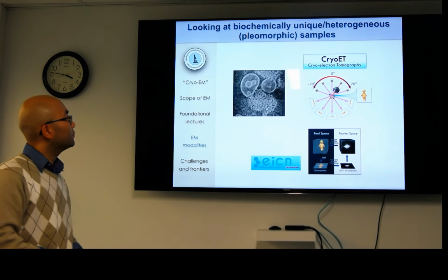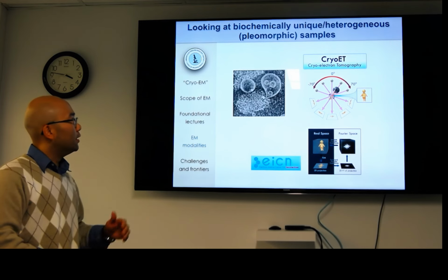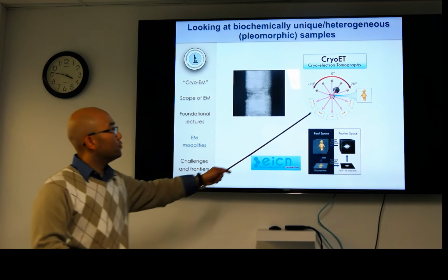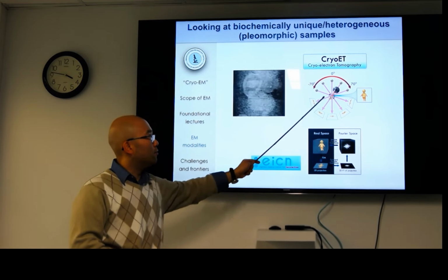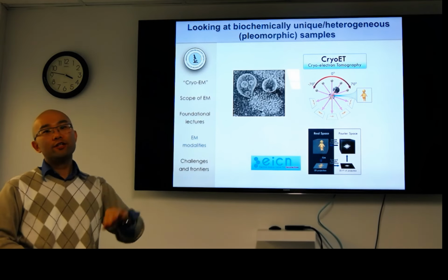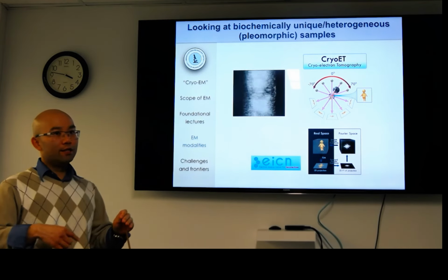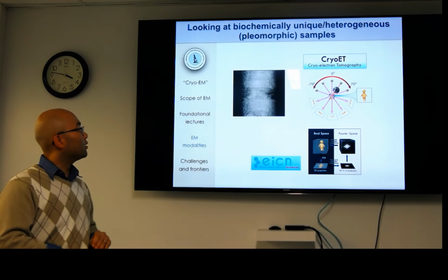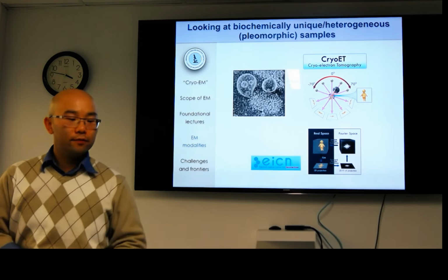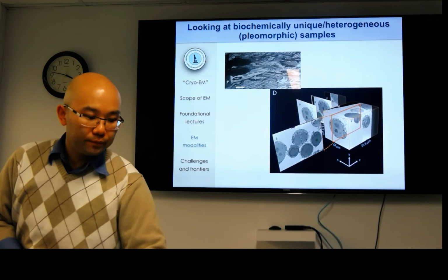Traditionally, electron tomography is very similar to a CAT scan, where you want several different views of a particular object and you can back project it. And in a sense, what you do is you tilt your sample, whereas in a CAT scan you tilt your sensor around, and you can get a 3D reconstruction of a particular region of interest.